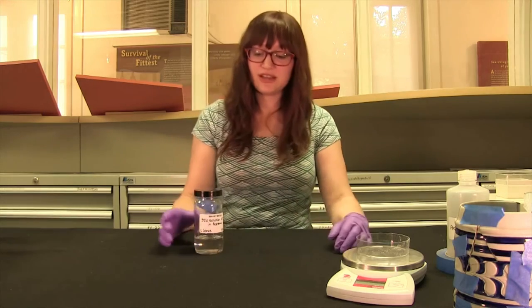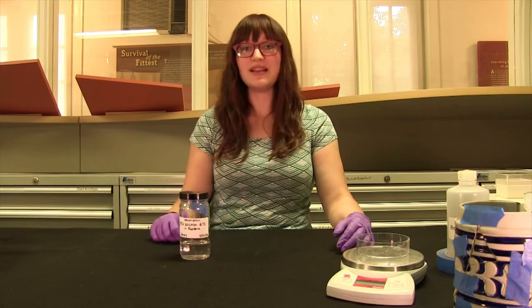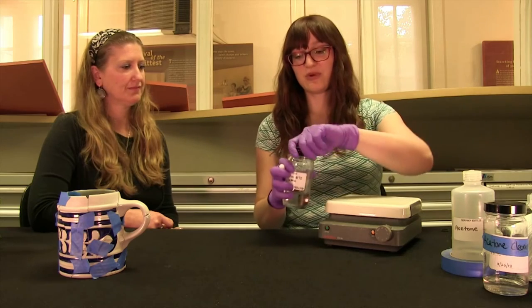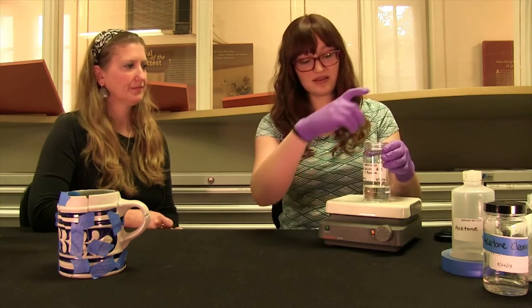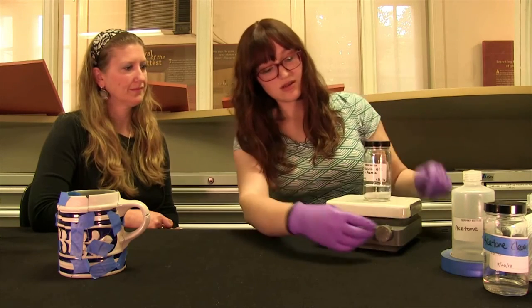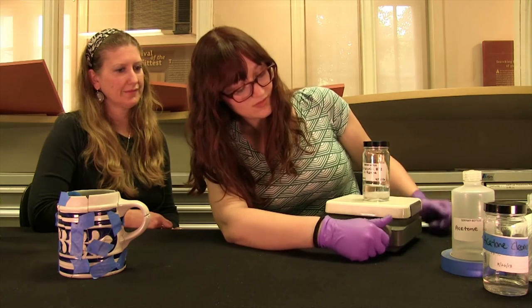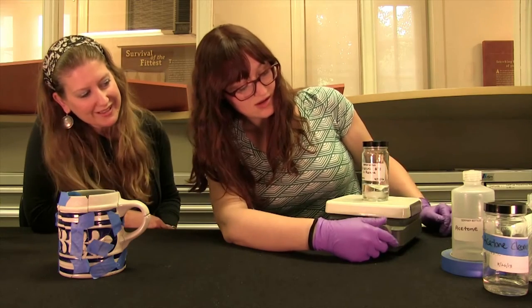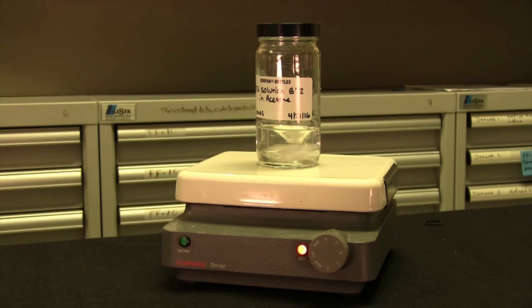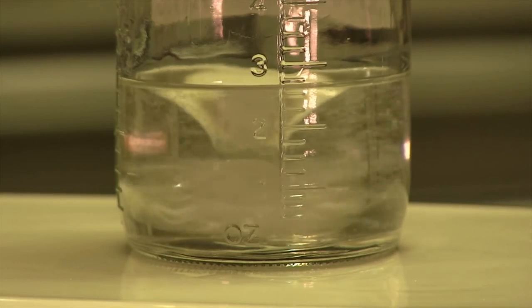Our glue is almost done. It just needs to be mixed really well and we're going to use our magnetic stirrer for that. This is our magnetic stirrer and this is our magnet. We're going to pop this in our archival glue solution and start slowly. It's going to sit on there for about five minutes and stir. This lets us be really precise about how long and how fast we mix our glue.